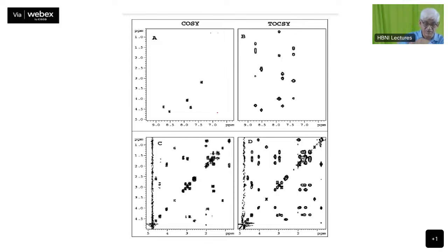NH to the C alpha. And you see how many peaks are there. So you say, okay, well, there are 5 peaks. Therefore, this is a pentapeptide. So all of these are non-equivalent. So I have 1 peak for 1 residue. NH to the C alpha, NH to the C alpha, all of them are there.